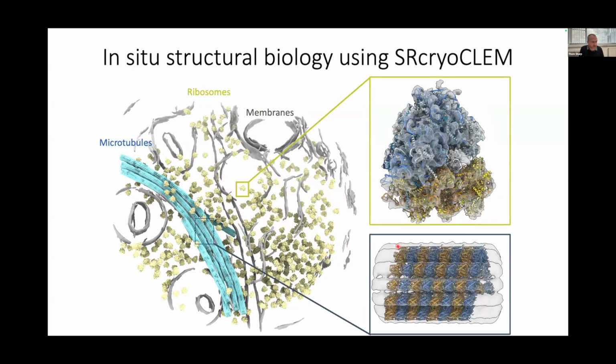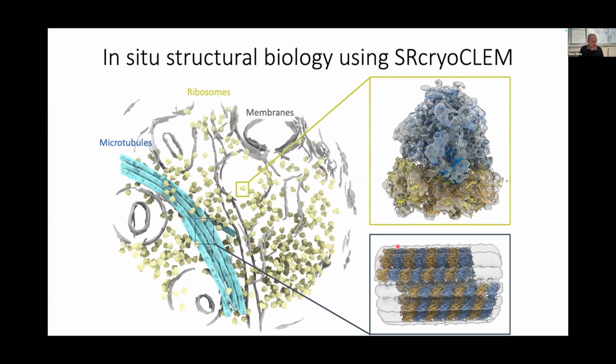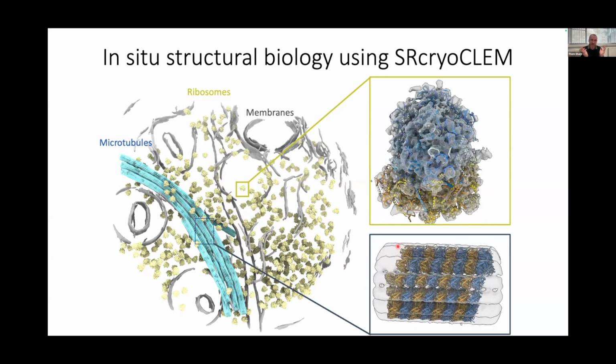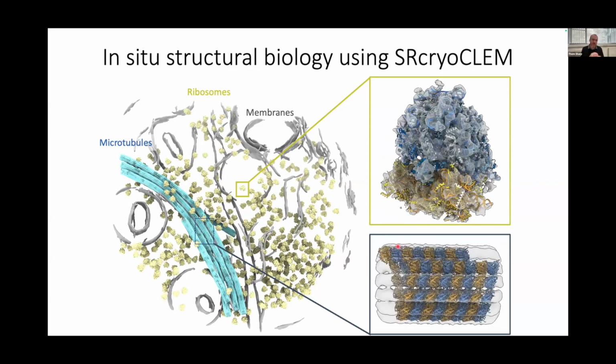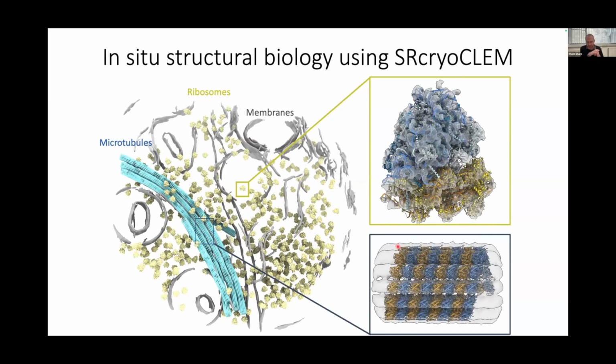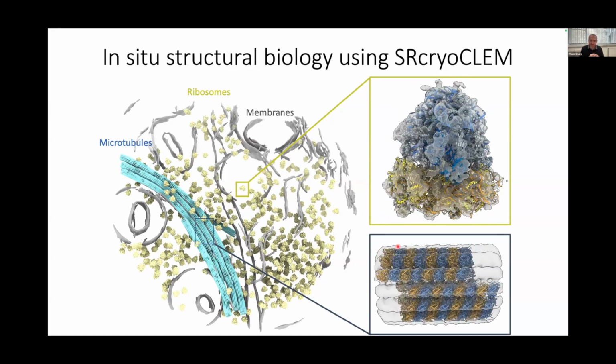Now in Bristol, I wrote a grant the first month I was in Bristol actually to get a cryo-FIB-SEM. And this is going to allow us to thin out pretty much any sample that we can prepare for cryo-EM. We can now make it perfectly thin enough for cryo-ET. So we should be able to get almost any biological sample and do in situ structural biology.